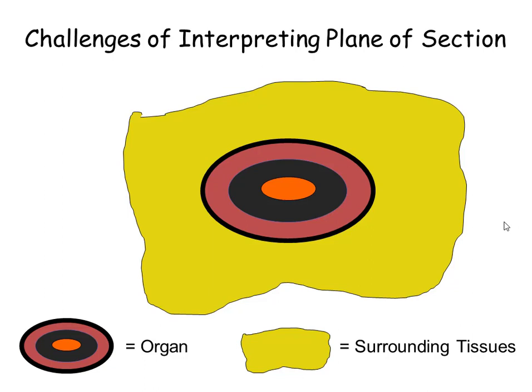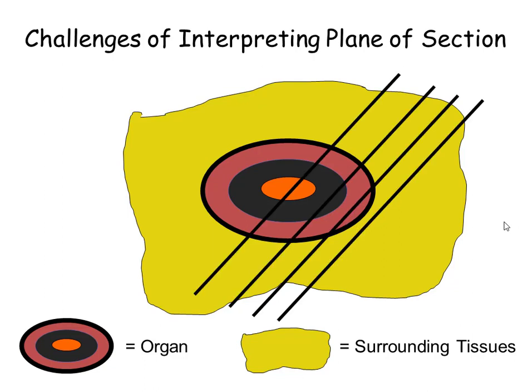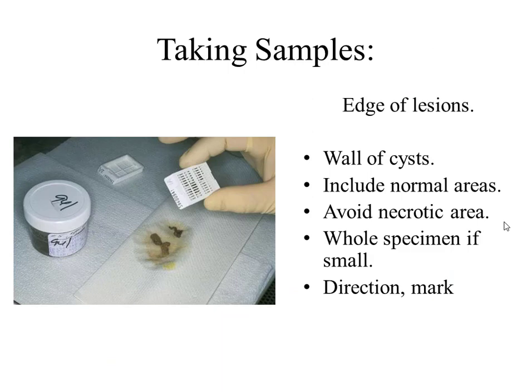On this picture, I want to show you how to cut the lesions, and we receive the slices which can be put into the cassettes or into the paraffin blocks, and then on the slide we have a clear picture. About taking of the samples also.